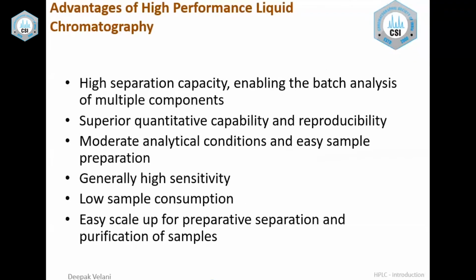So that is how HPLC has evolved from the 80s to nowadays, and has come out as a major technique which can analyze organics, inorganics, small molecules, large molecules, water soluble, water insoluble, everything. That is the advantage of HPLC: it allows you most possible things. If a compound can be dissolved, you can do all kinds of HPLC analysis. And you can extend it to purification or preparative chromatography. You can purify samples at small levels for analytical and characterization, and at gram and kilo levels for production.